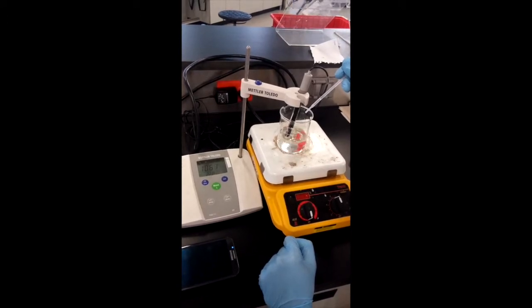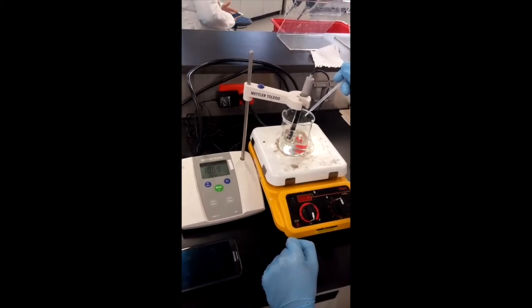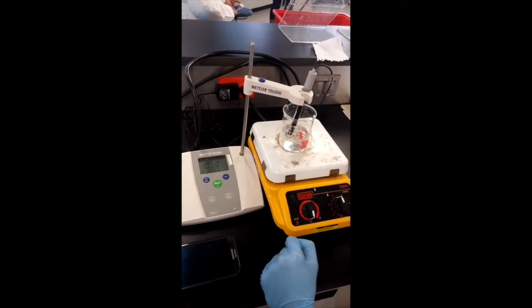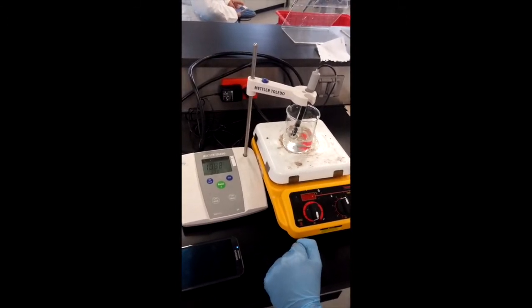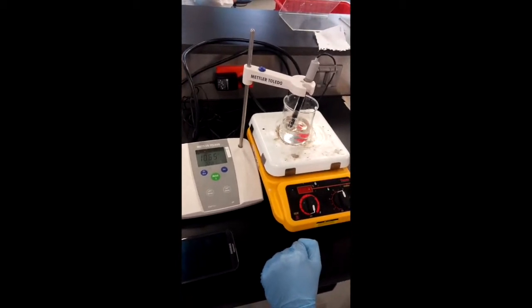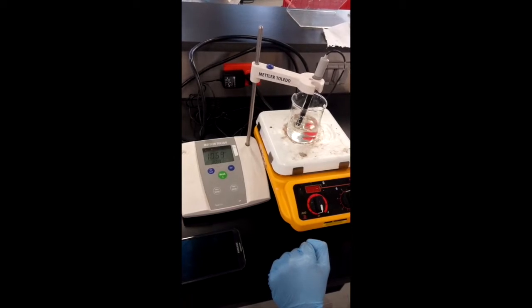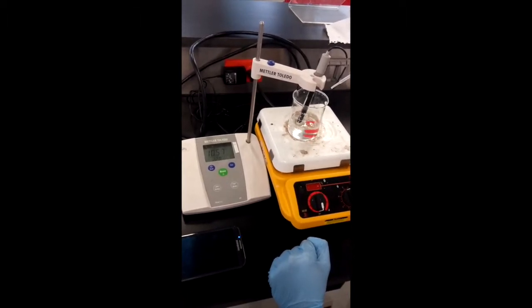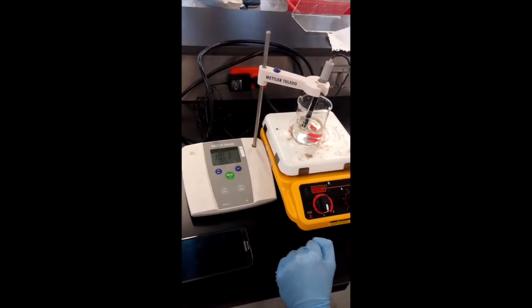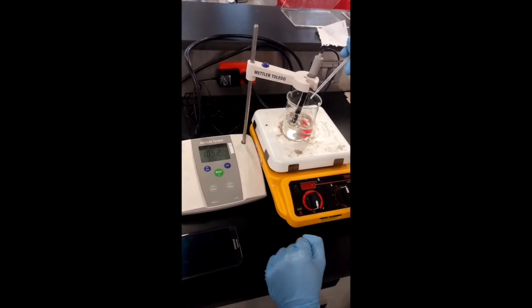The STE solution was prepared by mixing 0.96 grams of sucrose with approximately 2 milliliters of water. When the sucrose was fully dissolved, 1600 microliters of 1 molar Tris-hydrochloric acid was added and 1390 microliters of 0.43 molar EDTA. The volume was adjusted with distilled water up to 12 milliliters in the Falcon tube.